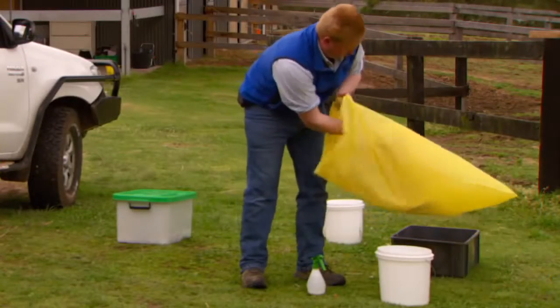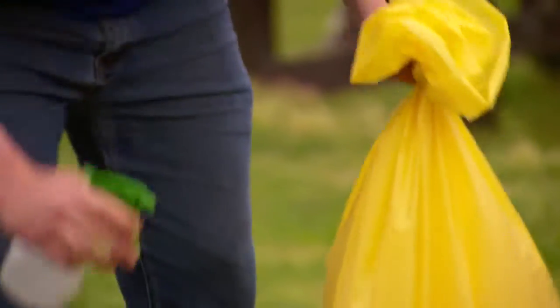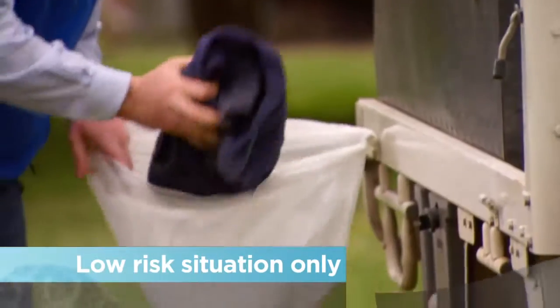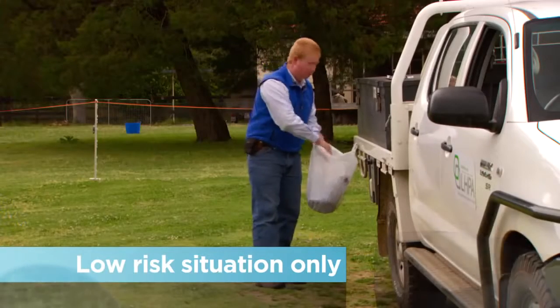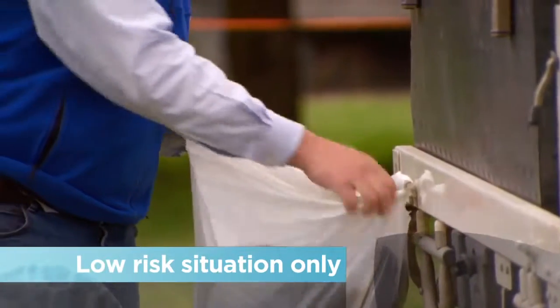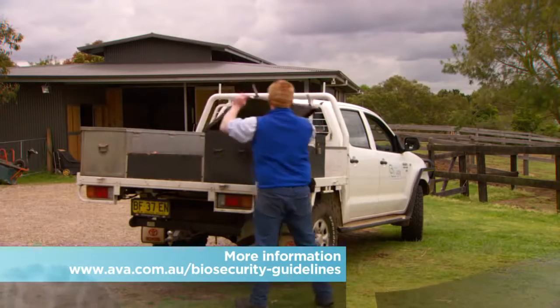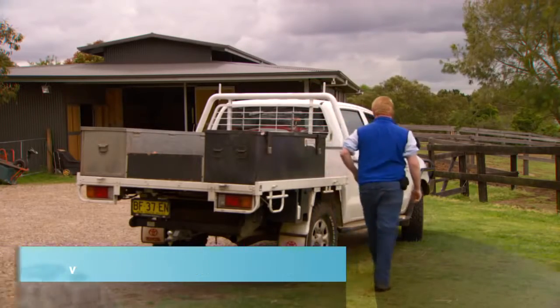In a normal, low-risk situation, disposable items such as gloves should be placed in a sealed waste bag and disposed of as clinical waste. Items made of fabric should be rolled up, contaminated side inward, and washed in hot water and detergent. Non-disposable items, such as goggles and stethoscopes, should have organic matter removed, be washed in hot water with detergent, and then disinfected. By learning and following these steps in the correct use of PPE, you are protecting yourself and others from the spread of disease.